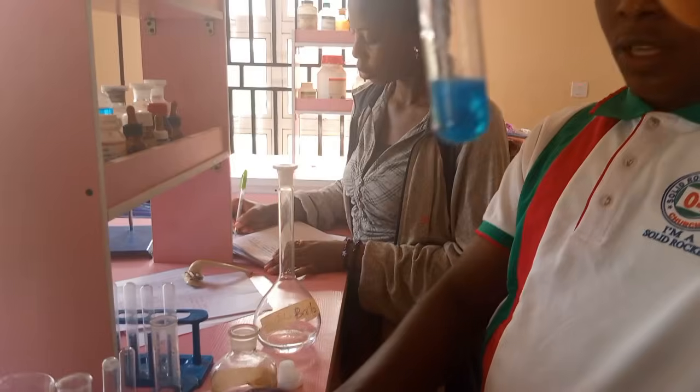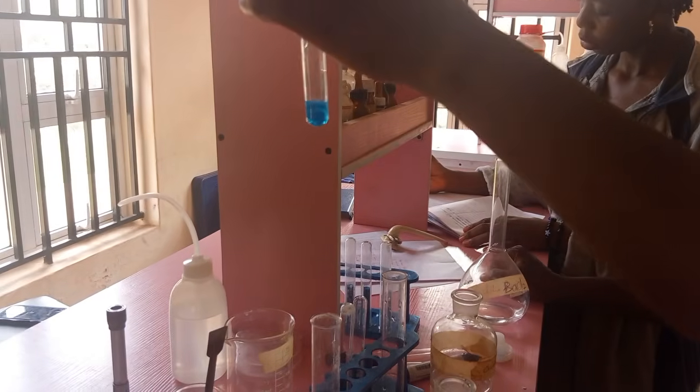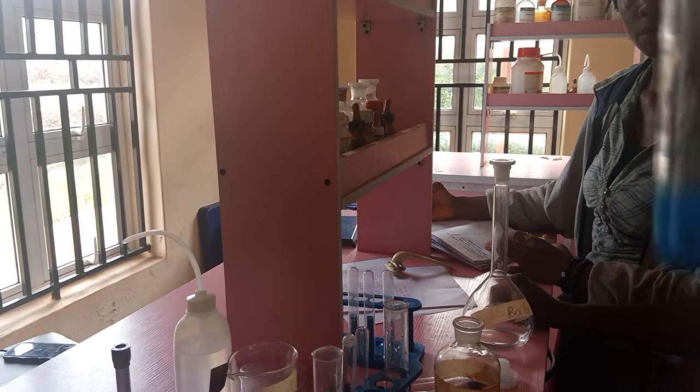Can you see what is formed? There's a blue coloration there, but something else has happened. Did you see what happened? It's a pale blue gelatinous precipitate. Pale blue precipitate.